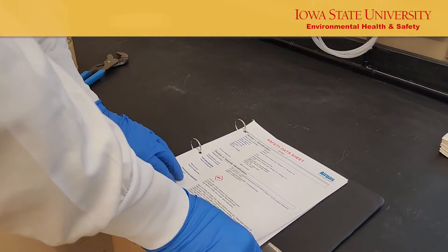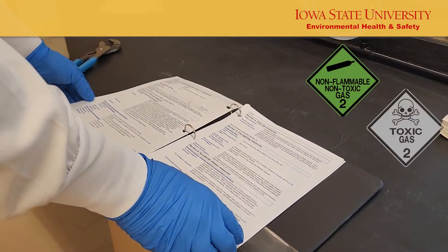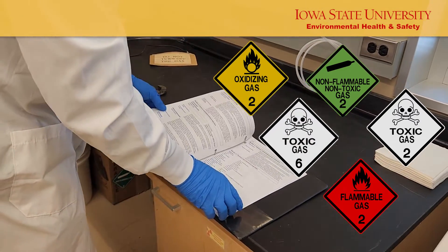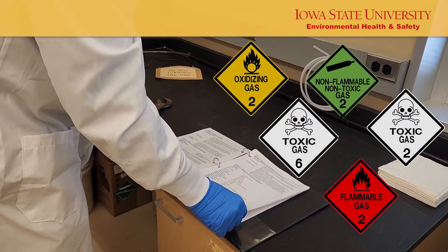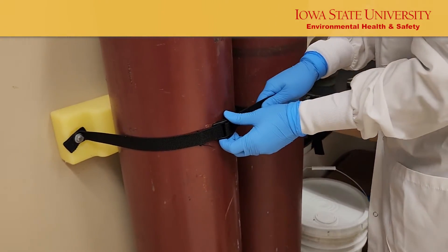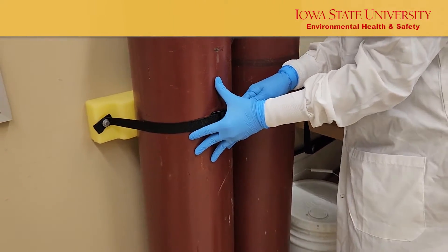Before installing your regulator, know the properties and hazards of the gas you are using. The safety data sheet should have this information, or you can contact the manufacturer. Secure the gas cylinder with a chain or appropriate belt above the midpoint but below the shoulder.